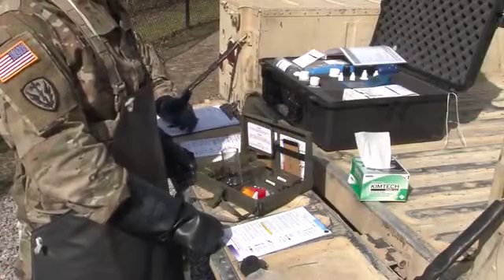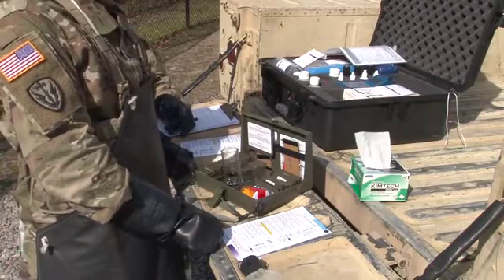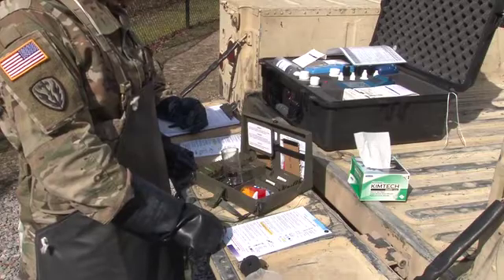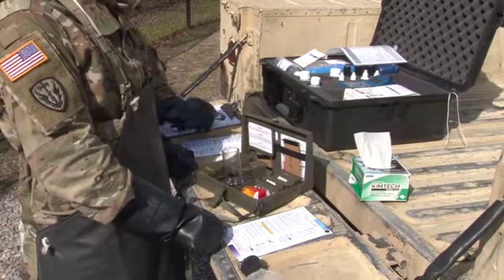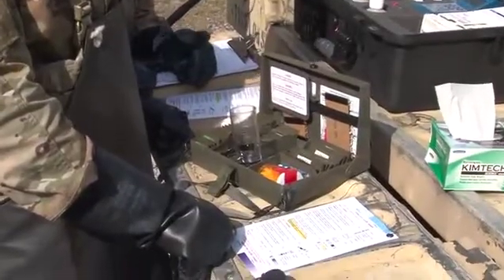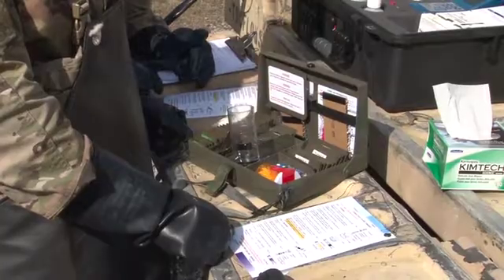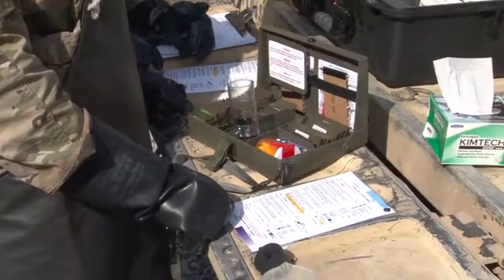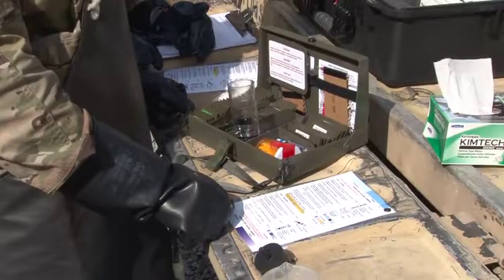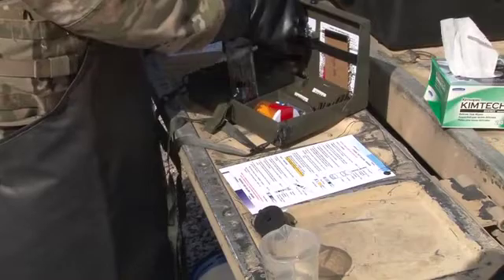Our third test will be for the presence of cyanide. Hydrogen cyanide is a cellular poison that is transported by the blood, causing a disruption in the oxidative processes used by the cells. Respiratory and cardiovascular collapse may result from cyanide poisoning. It is your job to do what you can to protect our troops from this blood agent. You will now perform a cyanide test on the same water sample.